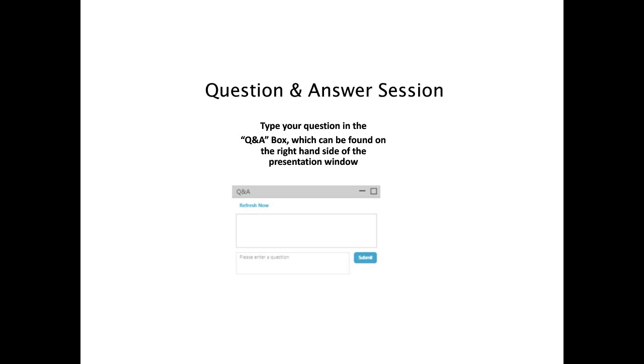Thank you very much. And one more question for you. Can we use the ViscoStar without LC separation, so direct injection of amyloid to the detector to determine RH? Yeah, so the whole webinar was focused on using it as an online detector where you fractionate the samples. You can use it in so-called flow injection mode, where you inject a small pulse, and that works fine. The idea there is you're not going to fractionate the sample, so you'll get an average of the species, or of the RHs or the molecular weight, of what comes through.